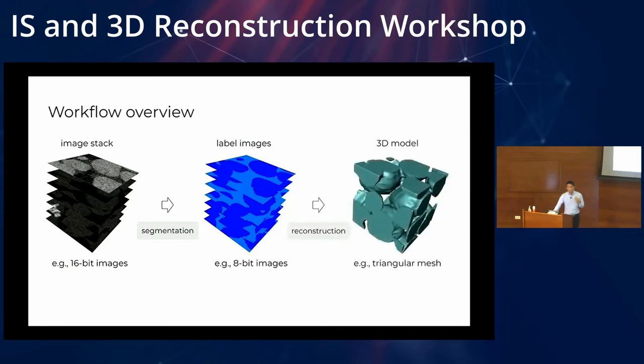Optionally, you can also perform reconstruction, which generates a mesh or a 3D model that allows you to do other things. Like I'll show you in a bit, you can visualize this in virtual reality. For scientific illustrators, you can plug it into your 3D modeling tools and tweak it for your illustrations. But mainly the goal is to get the segmentation for visualization and analysis purposes.